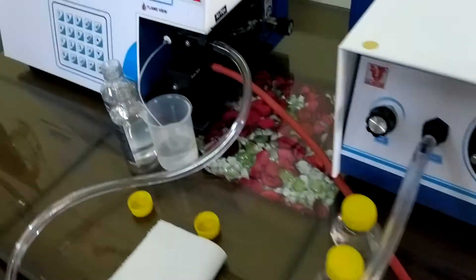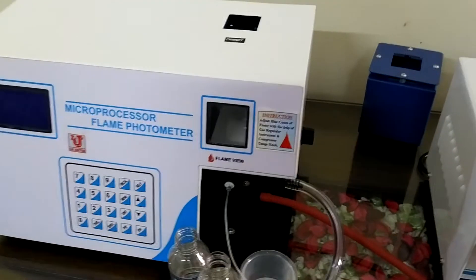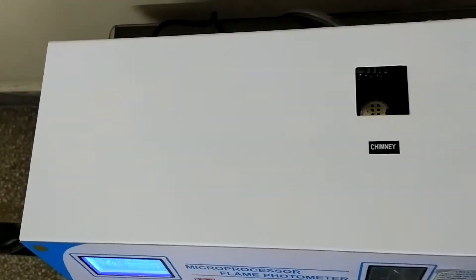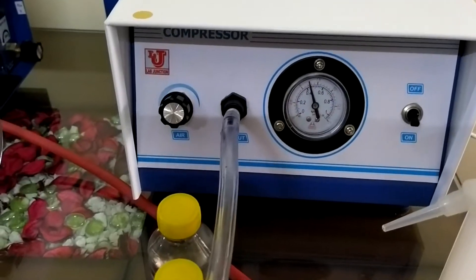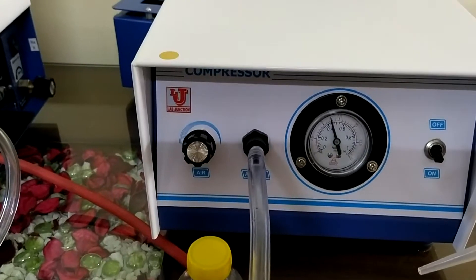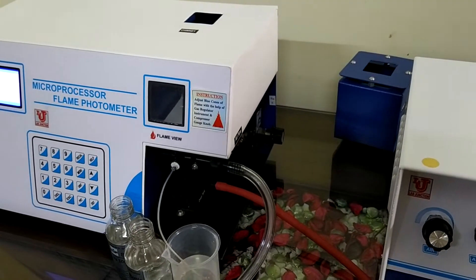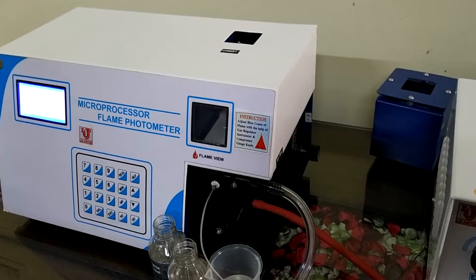Now, the main thing is how to light the flame of the flame photometer. First, switch on the main unit, then switch on the compressor. Sometimes the compressor takes 5 to 10 minutes to start due to power supply issues — in some areas the power supply does not reach 220V, it may be 210 or 200V.